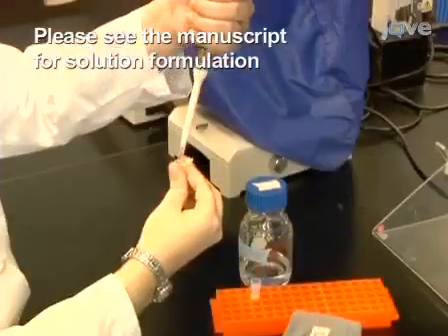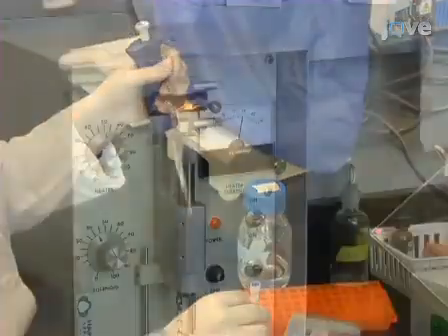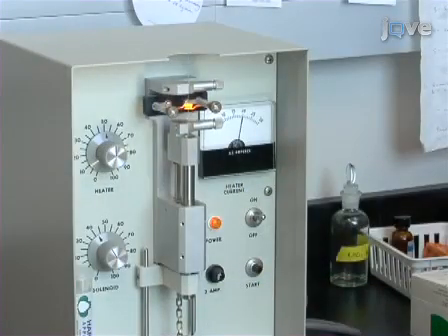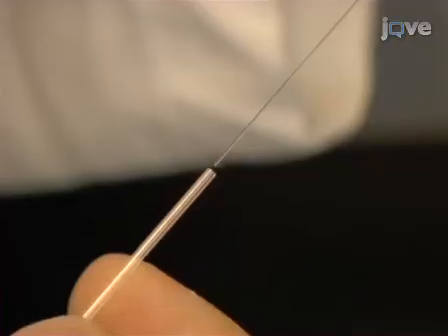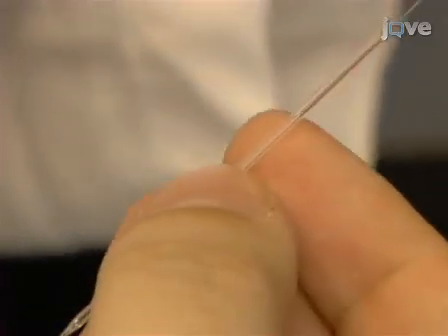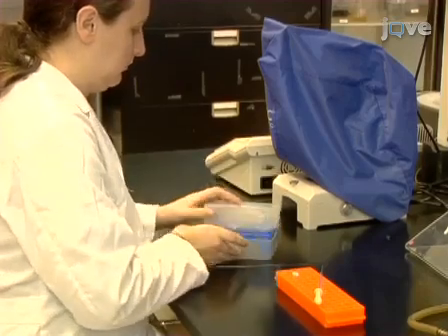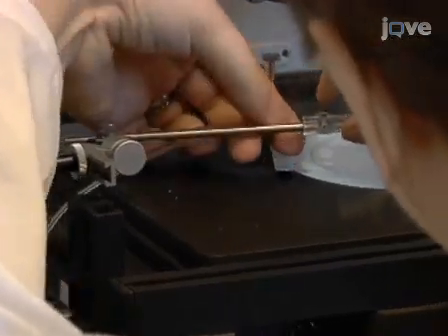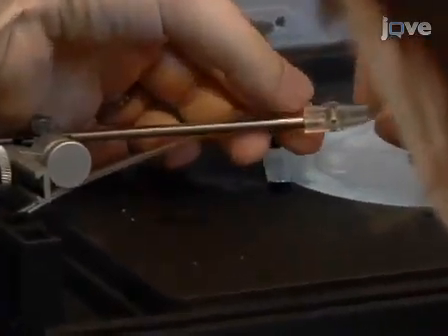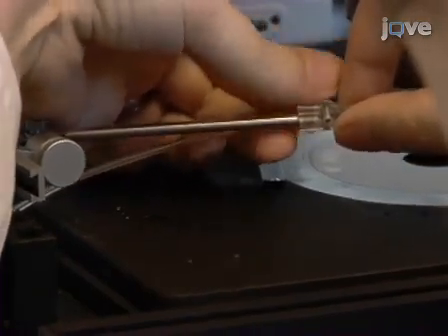On the day of the injection, prepare a diluted mitotracker or lysotracker dye solution and pull injection needles from a 1.2 OD glass capillary. Backfill the needles with a diluted dye solution and store them in a dark humidified chamber. Mount the injection needle onto the micromanipulator and connect the needle to a pressure regulator with a 1.2 mm internal diameter tube.